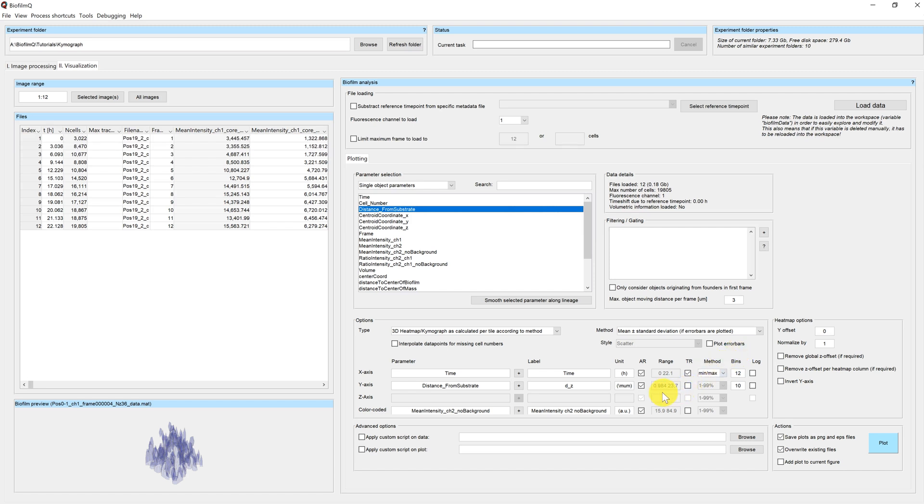And we can see here the range of our distance from substrate is up to 24 microns. So if we choose 10 bins for example, the bin size would be 2.4 microns, 24 by 10.